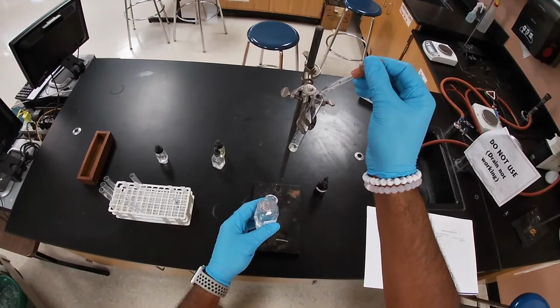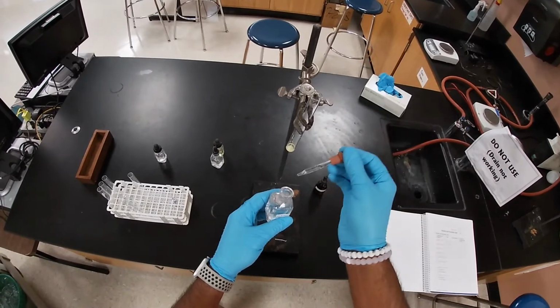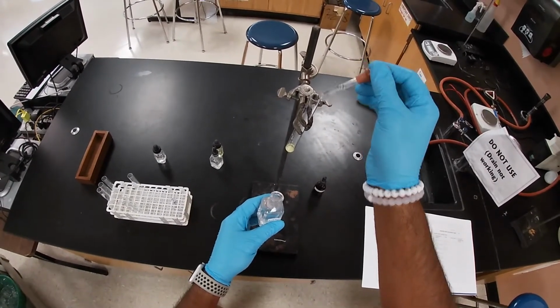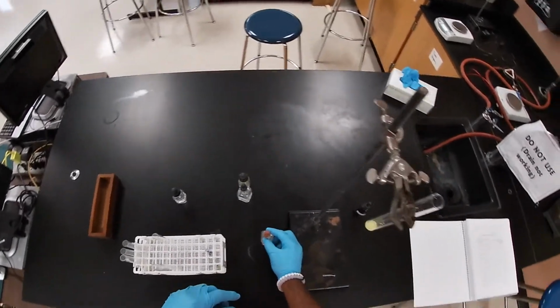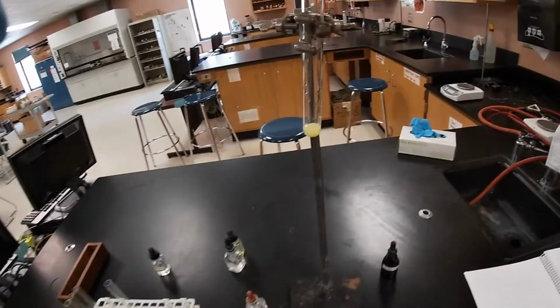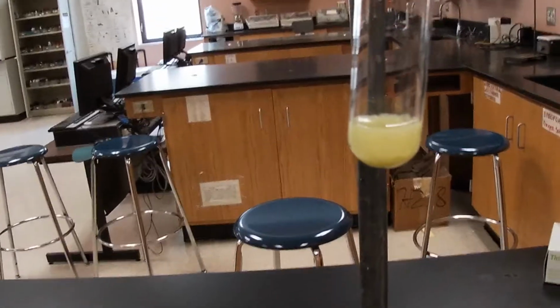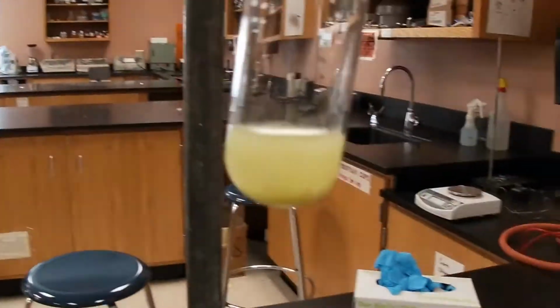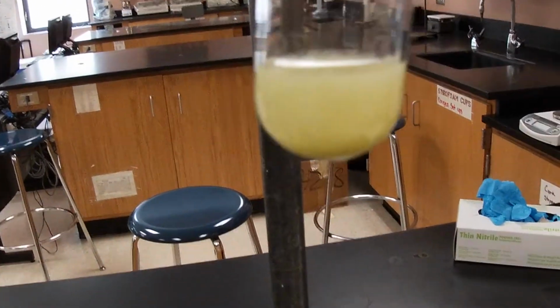Nice, we get some cloudiness. I'll add one more. All right, you notice something clouded up, and it's a different color this time, something different than we expected. Let me zoom in so that you can see. And if you notice, there is some settling at the bottom.